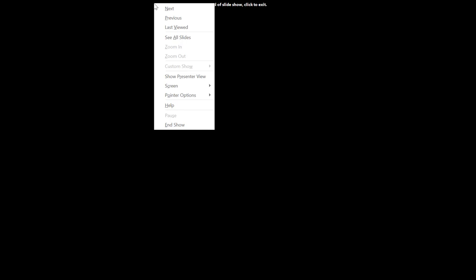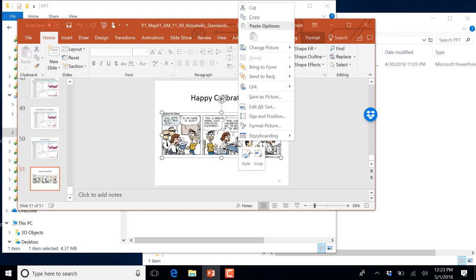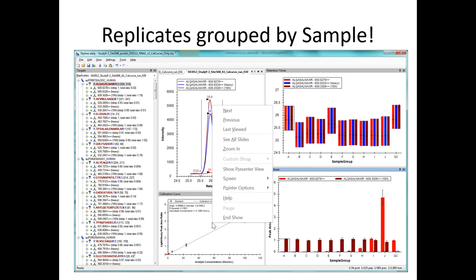If you click through the different peptides, you'll be able to see that the curve changes a little bit, whether it's the slope of the curve or where that plateau baseline is down at the bottom. And you can also take your curve and anchor it.